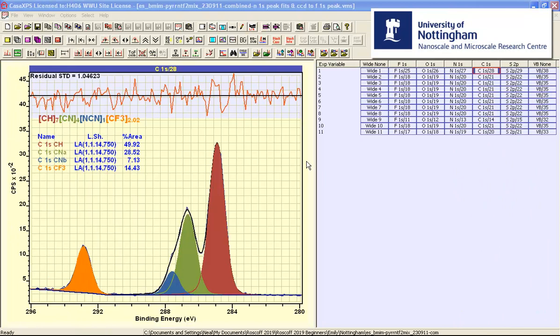In this video we're going to look at how to use Monte Carlo simulation to assess a peak model and its stability with respect to noise.